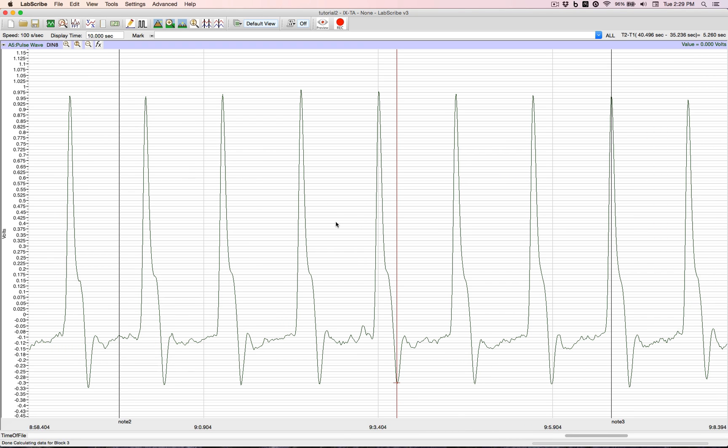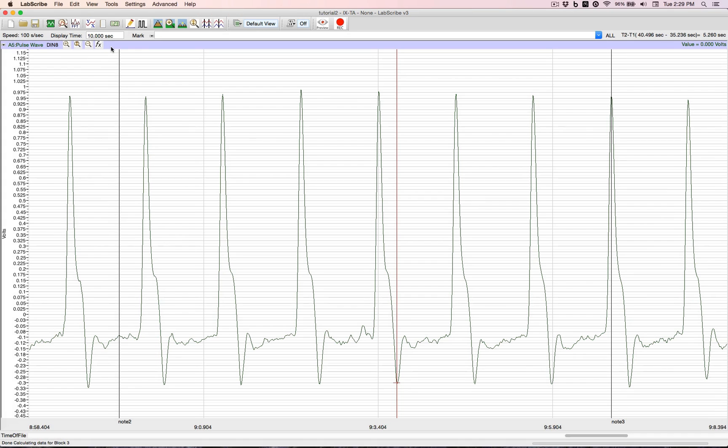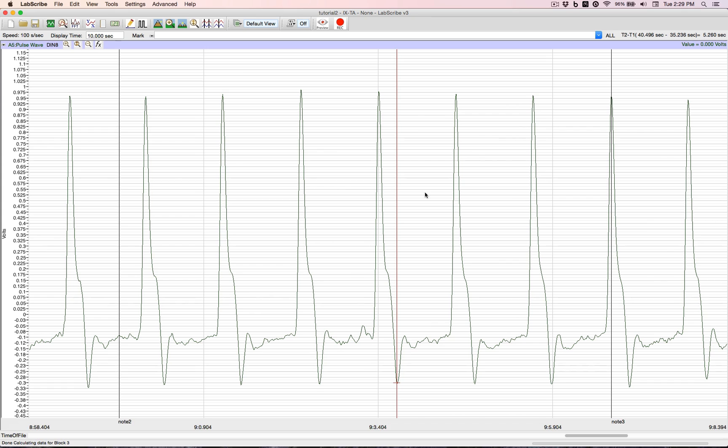Currently we have the display time at 10 seconds. What does that mean? From one side of the screen to the other side of the screen, we are displaying 10 seconds. We can change that.